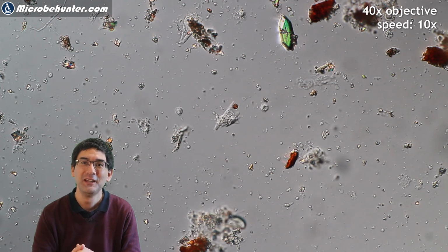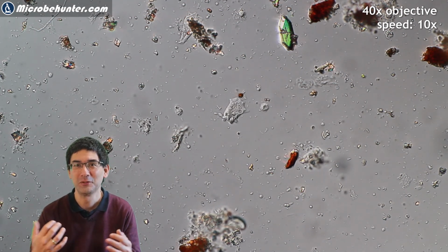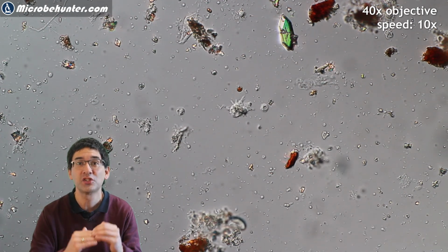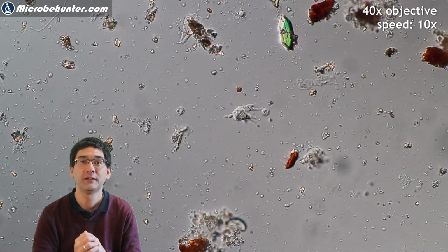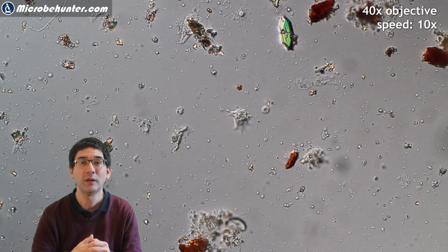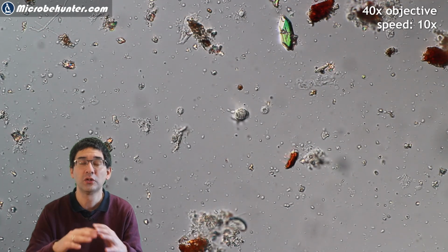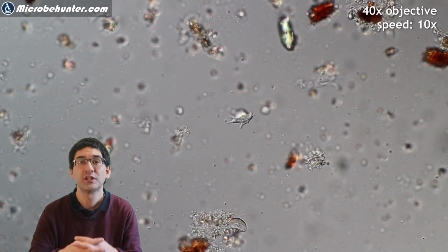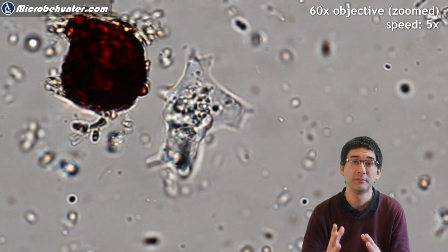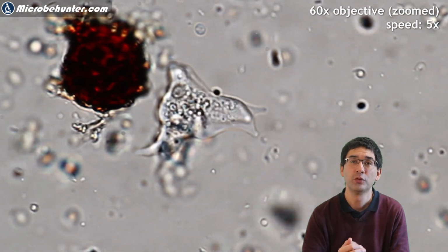But of course if you observe it directly under your microscope, you don't have time lapse, so you really need to take your time and you need to scan the slides systematically until you find those amoeba. What I've been doing then as well is, of course, I've been trying to look around for more of these creatures. This here, for example, is in bright field, and I really zoomed in a lot, I have to admit, to make it much more visible.